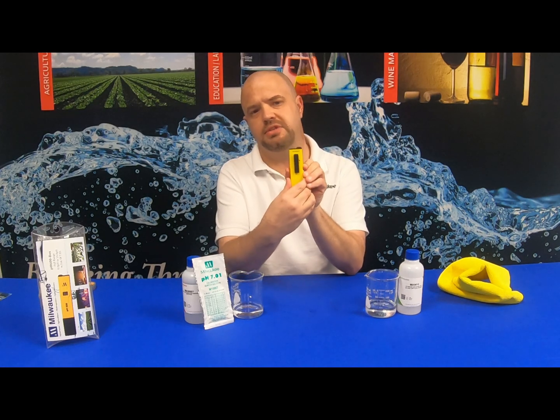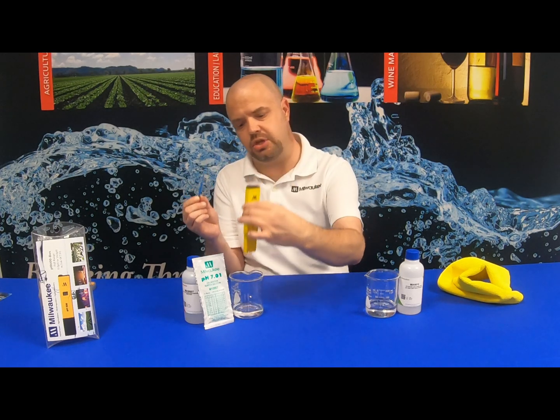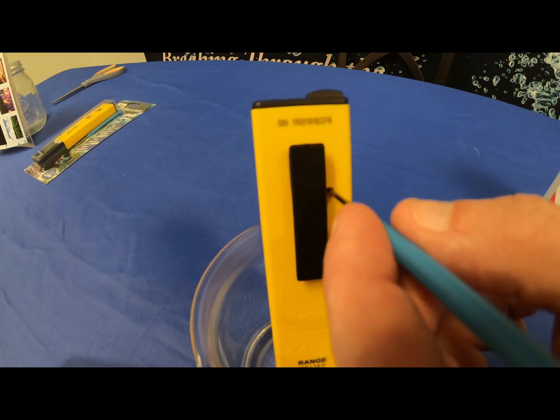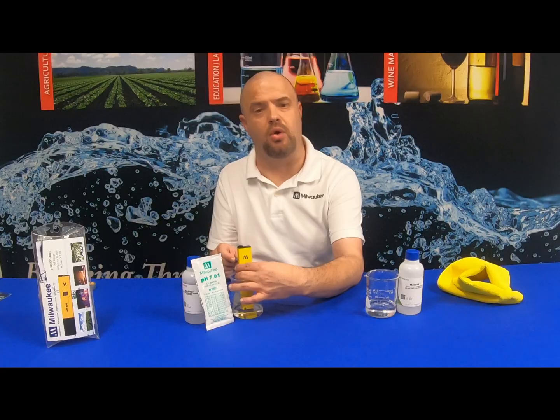On the back, you will see a calibration screw hole, which is where you take your screwdriver once the unit is in the calibration solution. Place the screwdriver in and dial until it reads 7.0 on the display. Your unit is now calibrated and ready for use.